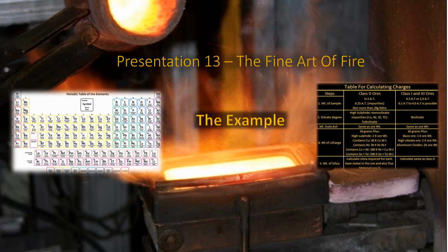In presentation 11, I talked a little bit more on how you can identify what you may have in your ore or concentrates, and how you may be able to estimate the percentage of concentration. In presentation 12, I introduced the charge table. Well, in this presentation, I will be showing and discussing the actual use of this table.